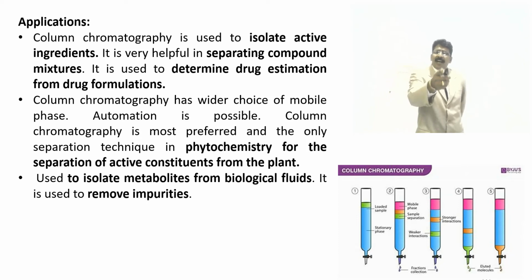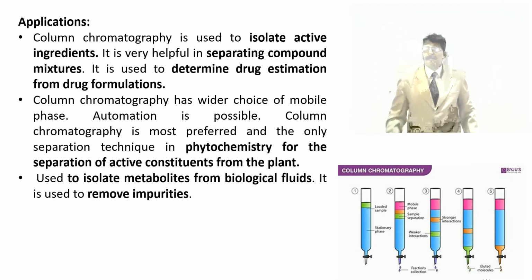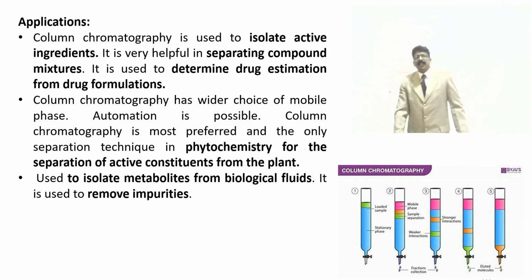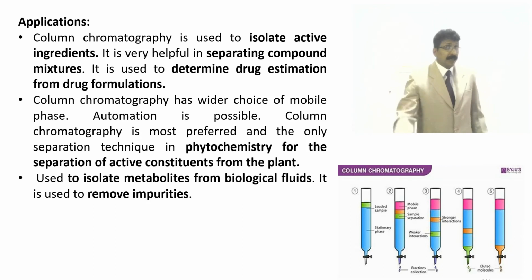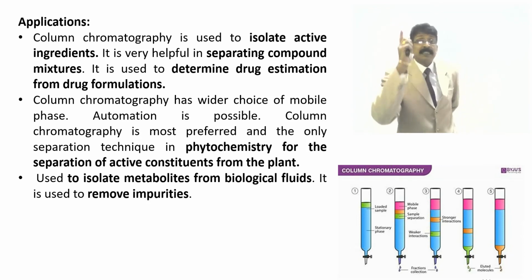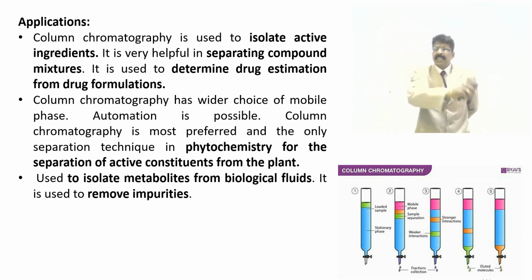See how important it is. In phytochemistry, if you want to do separation, you have to do column chromatography before going to TLC or any identification. It is a must for any student. I don't know why it was not preferred for the project, but it is necessary for anyone to go for column chromatography. It's a simple technique when compared, and also a very interesting technique.